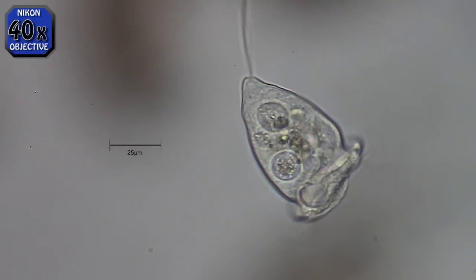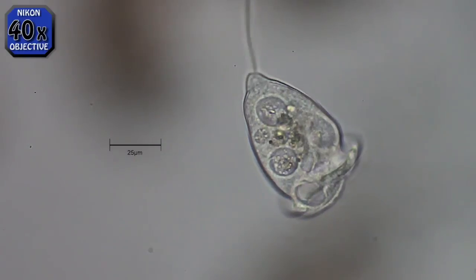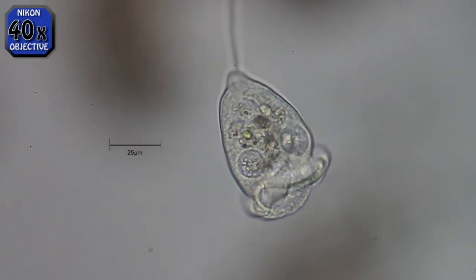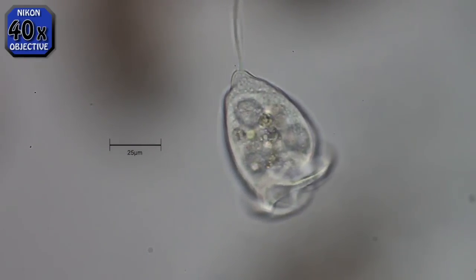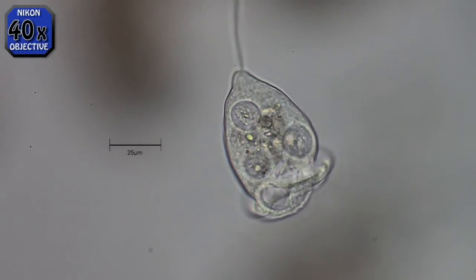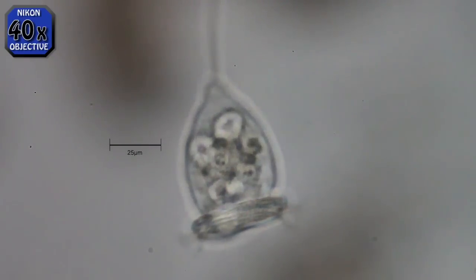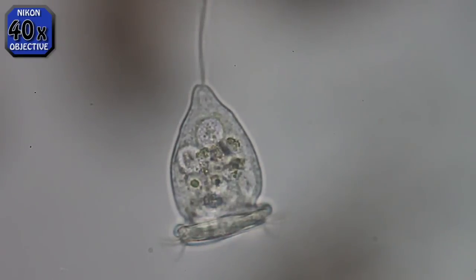Then it goes around, and there's one on the left side coming to the lower edge of the body just above the cilia ring. That one has been in the system for a while and already digested most of the stuff. If you look right below that, you'll see another vacuole that looks flattened and empty. They move up to that point — there, it just kicked out a little bit of leftover waste that didn't get digested. The empty food vacuole is being absorbed.